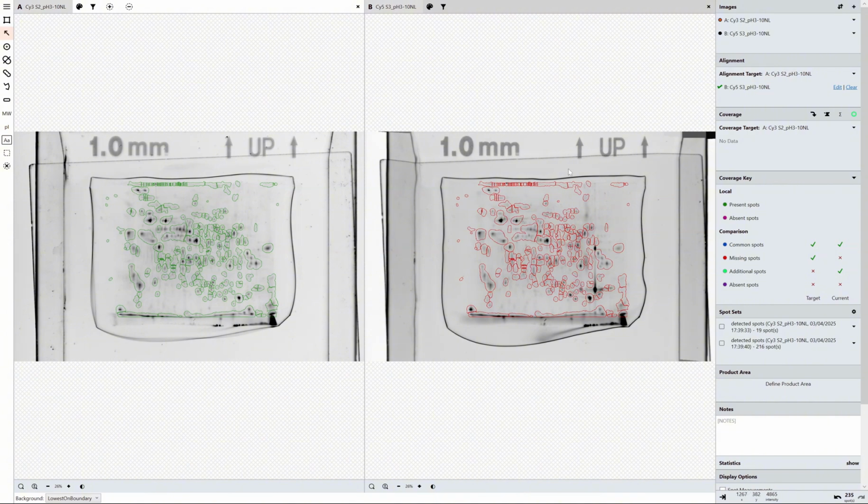And you won't have seen it there because it's really quick, but this image has now slightly moved or changed to match, using the alignment vectors that we included there, to match this image. So we're now working on an aligned image. So the next step is to start actually calculating our coverage.